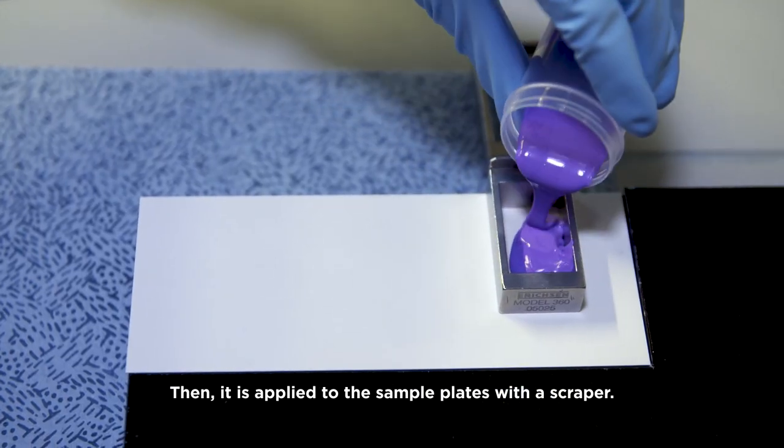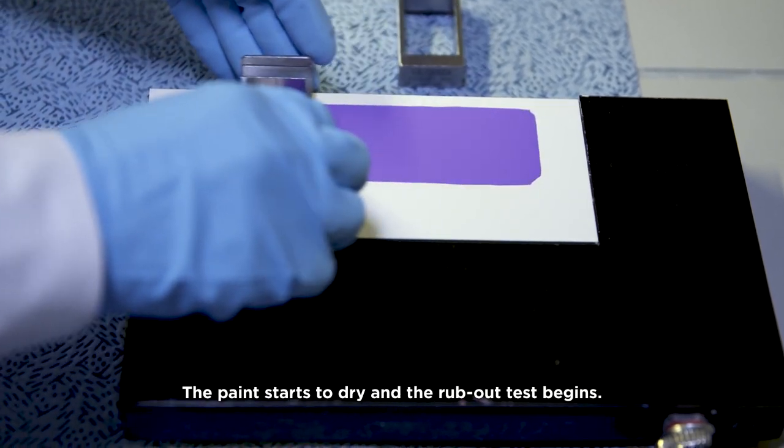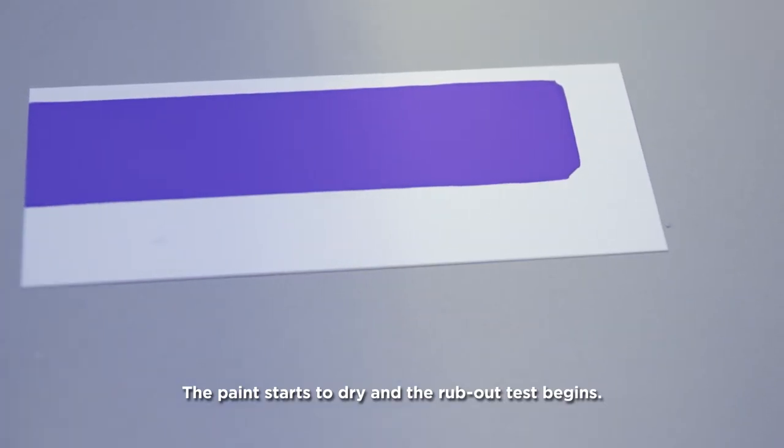Then it is applied to the sample plates with a scraper. The paint starts to dry and the rub-out test begins.